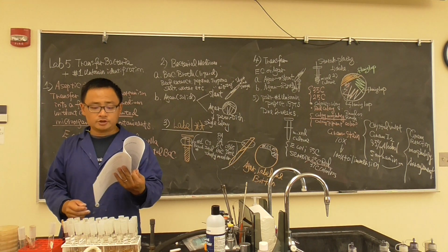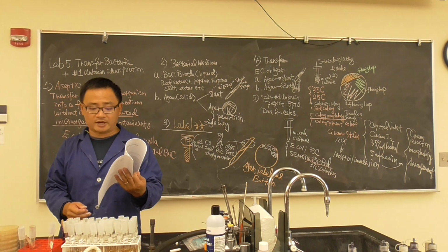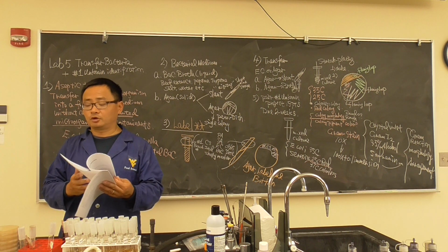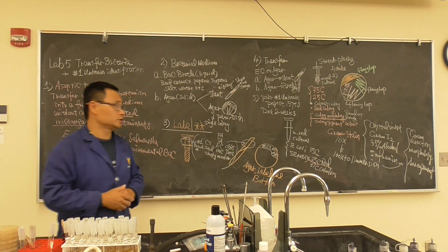Now, in this chapter 8, what I wrote is Micrococcus, but I don't have that strain. So this time we're using Serratia. Okay, we're using the Serratia. I'll send an email to everybody, and or put it on eCampus.